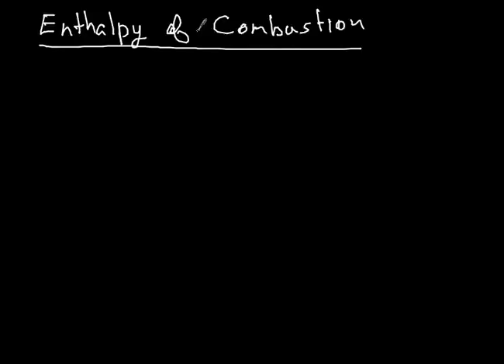All right, the enthalpy of combustion experiment is another one. Once again, we want to get the heat. The Q is what we want to get. And so we need to be able to record a delta T as something heats up or cools down. In this case, it's going to heat up because combustion is exothermic.